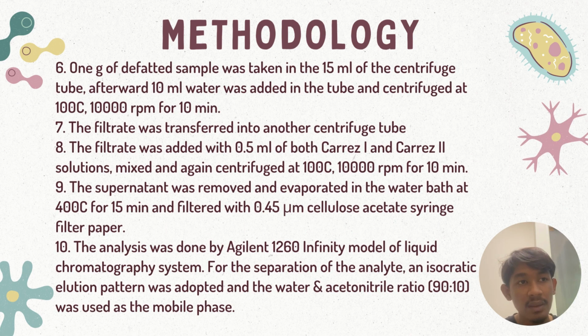And then 1 gram of defatted sample was taken in the 15 ml centrifuge tube.